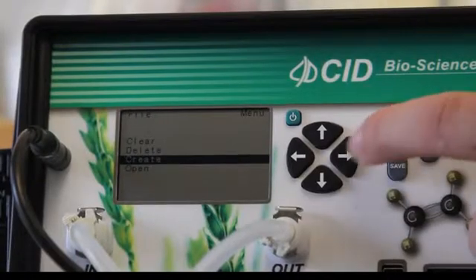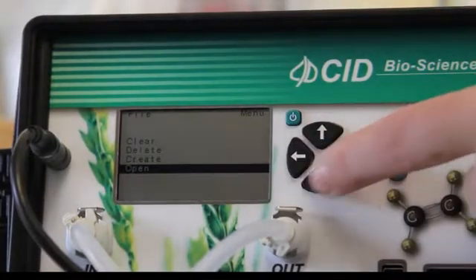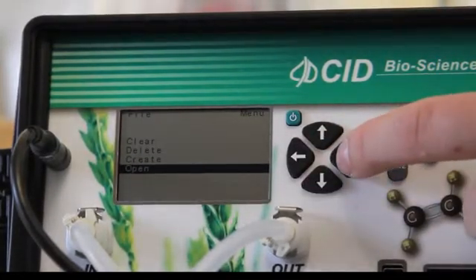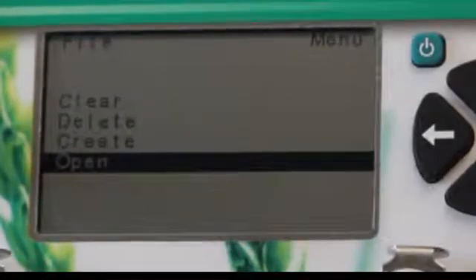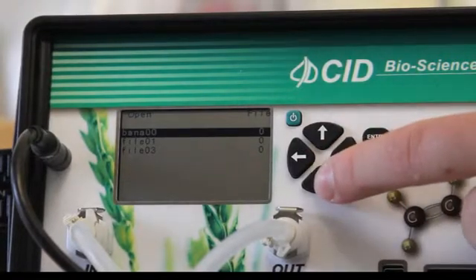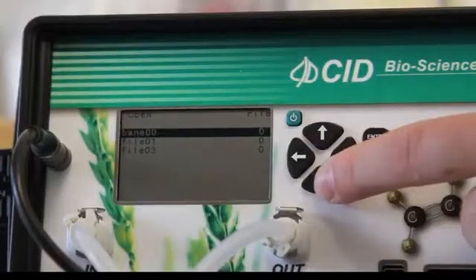Press Enter to save it. Before we start the initial loop, we have to open the newly created file by opening the File menu and then selecting Open. Now we look for the new file name we created, select it, and use the right arrow key to open it.